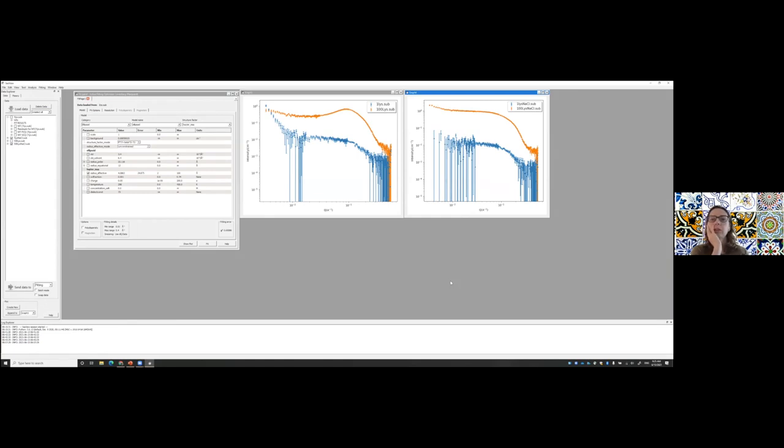Again, one of the things you may want to consider when you're doing a SANS experiment is how much salt to put in the buffer. It should be the same molecule, right? You'll see in the tutorials that I put some questions there to make you wonder about a few things. In case you don't have any questions and you just followed all the steps and everything works, I want you to also question the results. So I put some teaser questions in there to make you think about this a little bit.